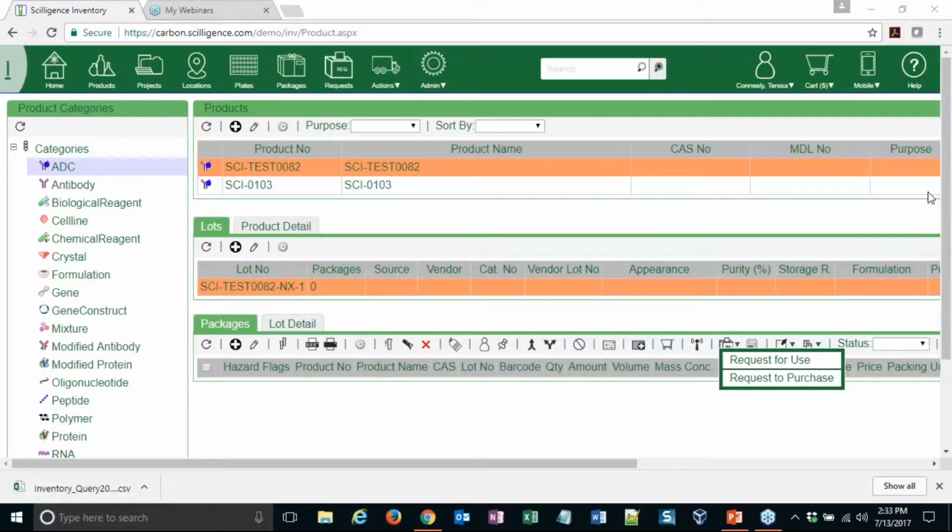Can you enter in a plate filled with compounds for a biological assay? Yes, I believe you can. If the information is in an Excel spreadsheet, you could upload that information straight into the plate template.